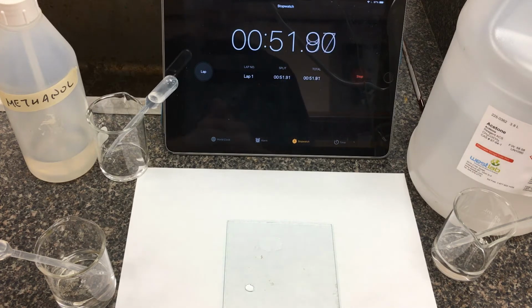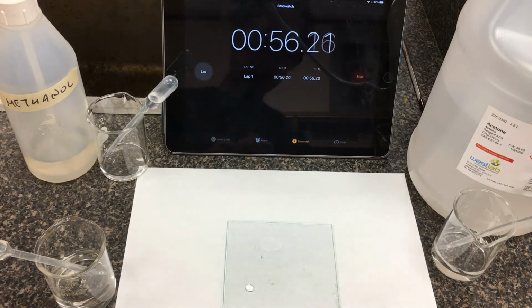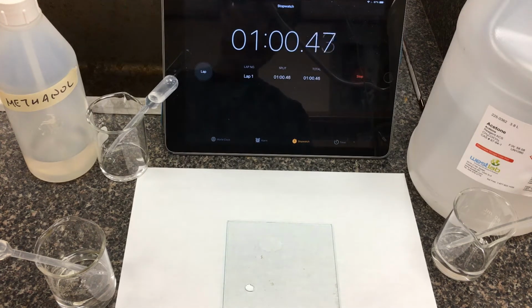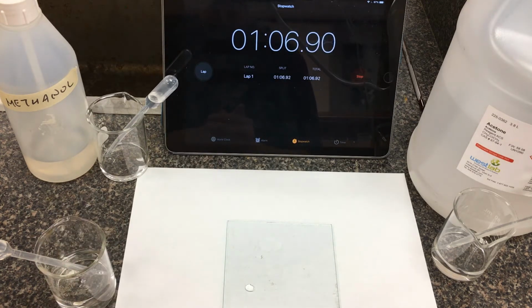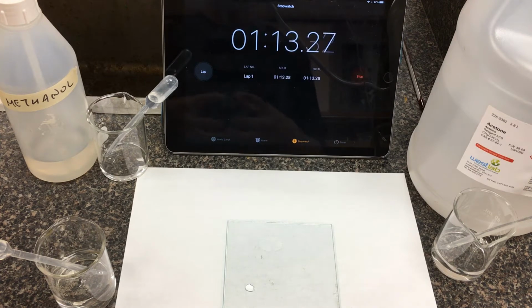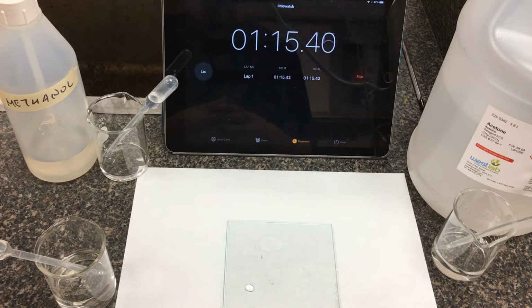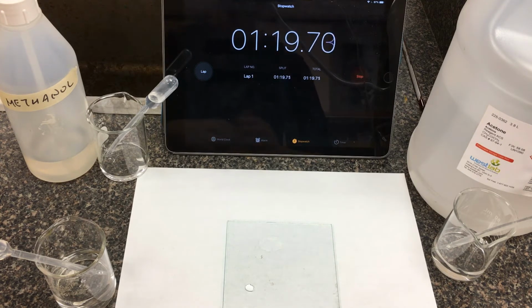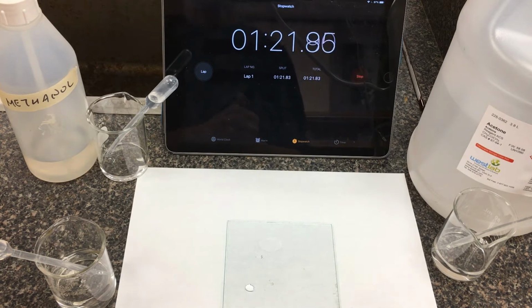They use acetone in a lot of nail polish removers, so if you accidentally got some polish remover on yourself, you probably felt a very cooling effect. I don't know if it's clear on the video, but this acetone puddle has basically evaporated away in about 1 minute and 5 seconds or so. So that's, again, a qualitative comparison here. Liquid to liquid, it doesn't hold itself together very strongly, so again, it evaporated off quite quickly. In biology, you would call that evaporative cooling.